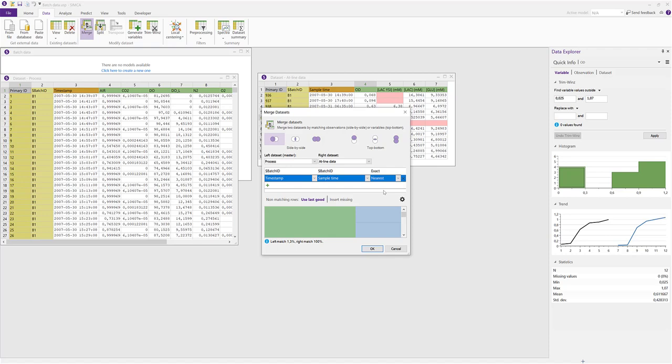But in this case we are likely to end up in a situation where the at-line data sample time is matched to a process time with an earlier timestamp because it was nearest. This does not represent reality, since the data from a sample should never be allowed to be matched backwards to an earlier point in time. So to counteract this, we choose the merging criteria forward instead.